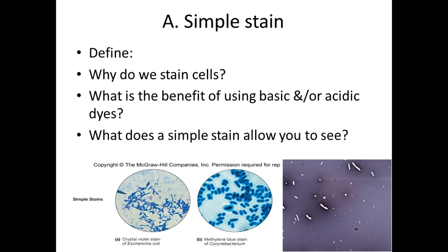Acidic dyes, on the other hand, have a negative charge, and the cell is negative. So we've got a problem here where we're doing what instead? We're not attracting. We're repelling. Right, so that's what's happening in this picture here with the dark background. That's an acidic dye known as nigrosin, and it's being repelled by those negatively charged cells. And anything else negatively charged on that slide, unfortunately. So it's like when you try to put two magnets together the wrong way, you get the two like poles, right, and they just keep flying apart. You just gotta flip them over, and then they'll stick.